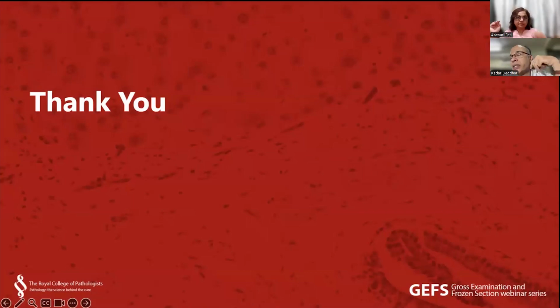For segmental maxillectomy or mandibulectomy, should we put the entire specimen in decal, or should we try to separate the mucosa and soft tissue margin first? What do you recommend? So the best way for any tumor with bone is to try to keep a little bit of tumor with the underlying bone so that we can see the bone and tumor interface. Don't submit the rest of the tumor in decal, but definitely we want to see the tumor and bone interface.